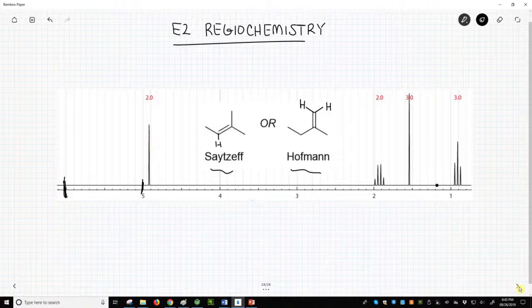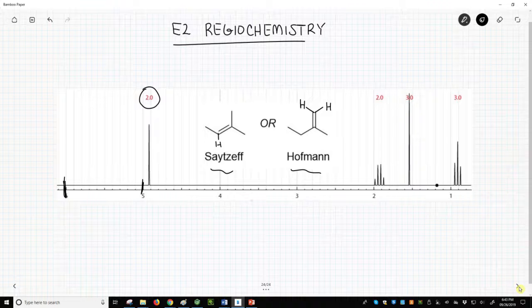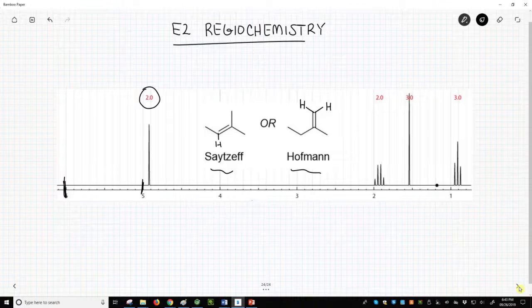Now this peak is a little bit short of 5 ppm, but clearly we have 2 hydrogens in the alkene region.